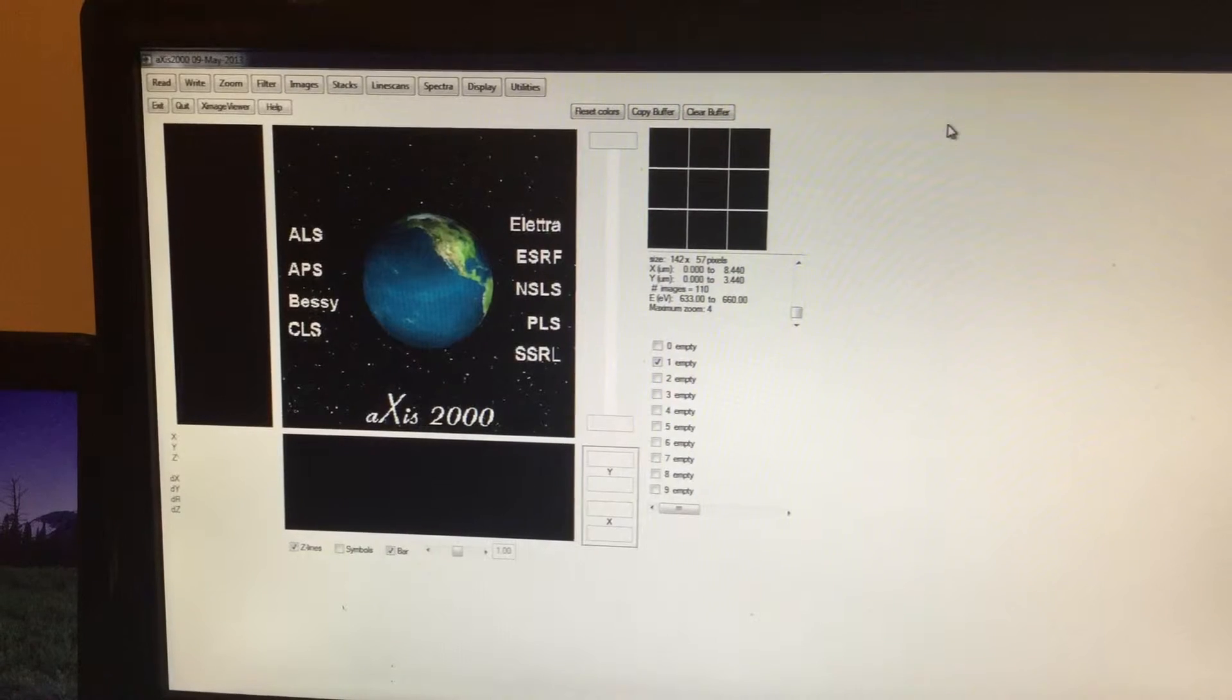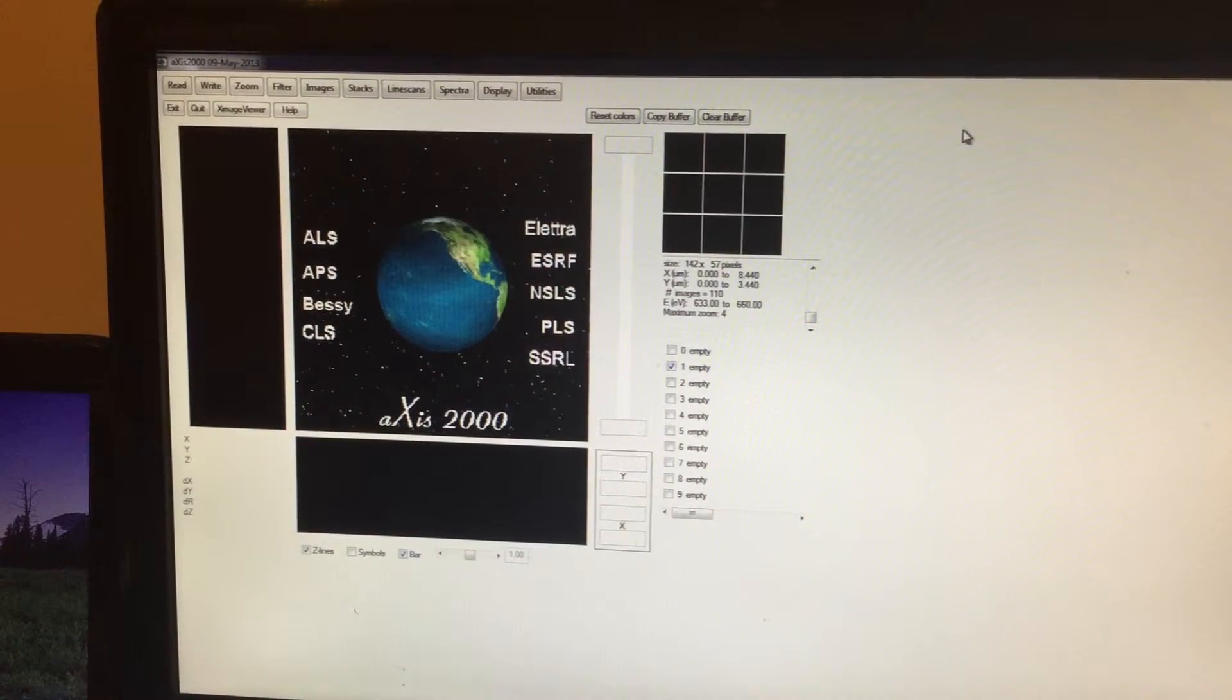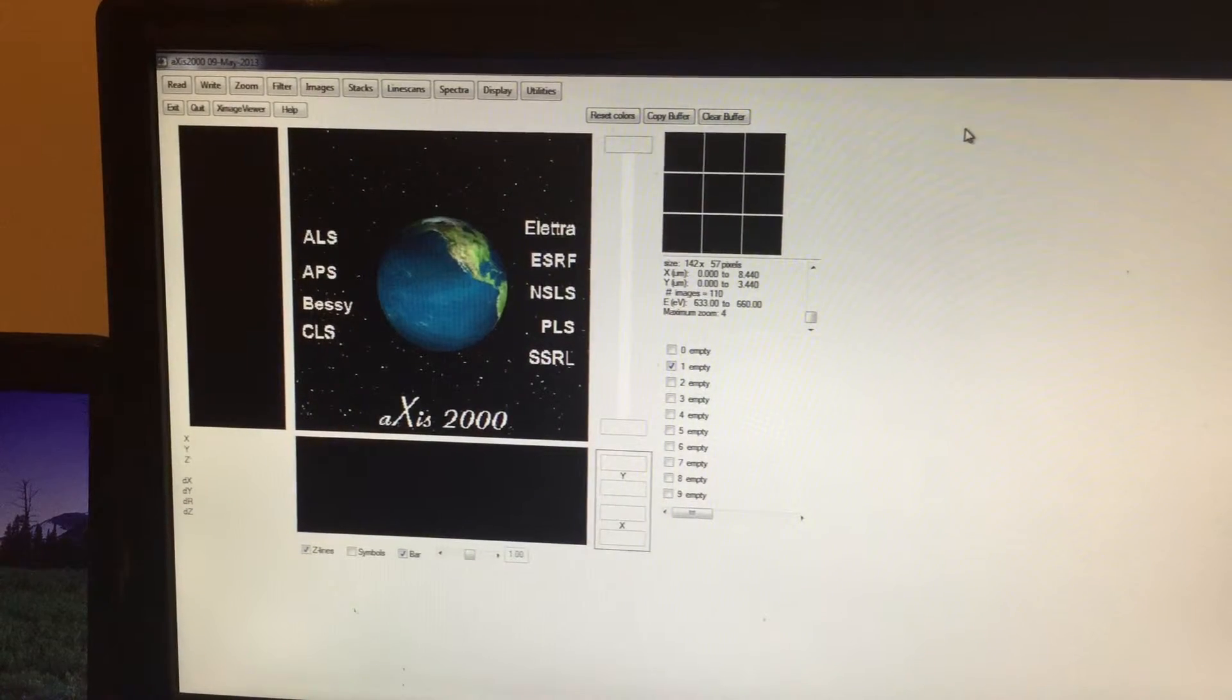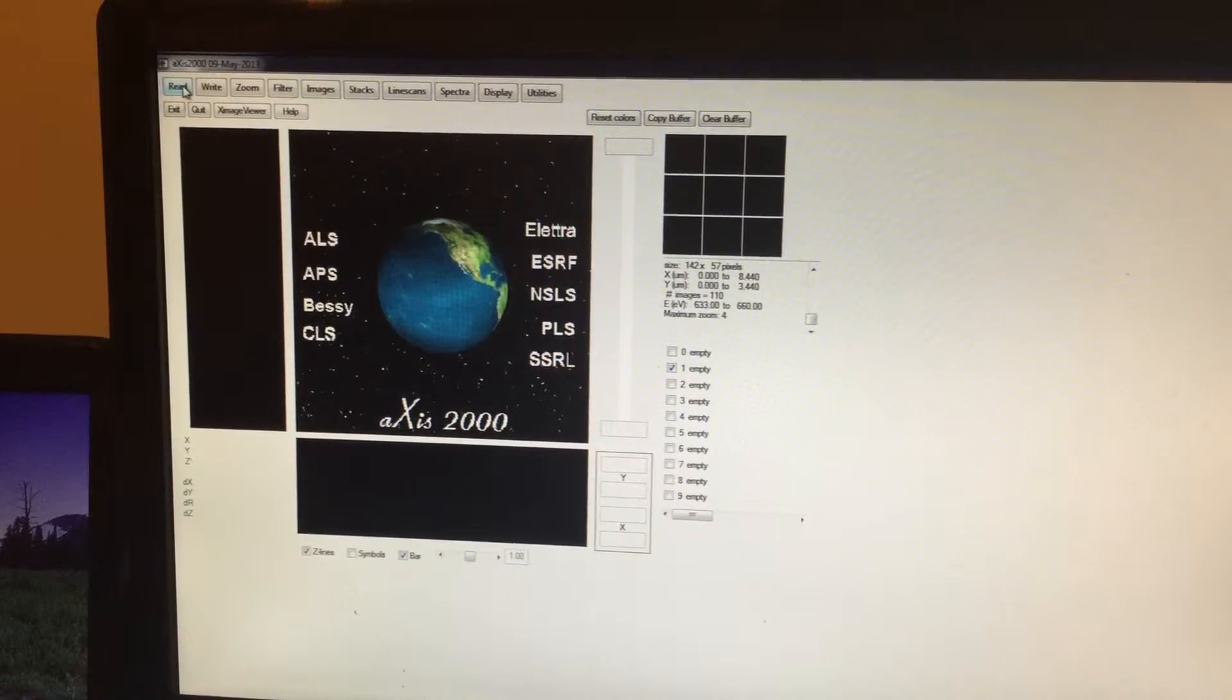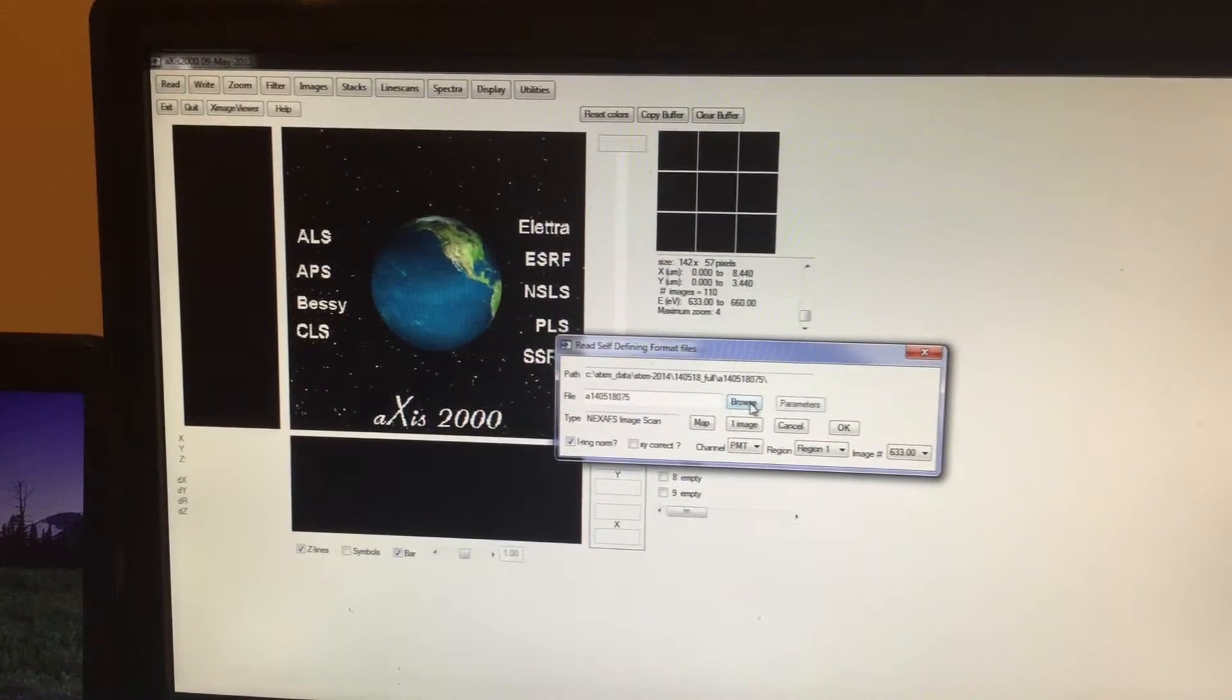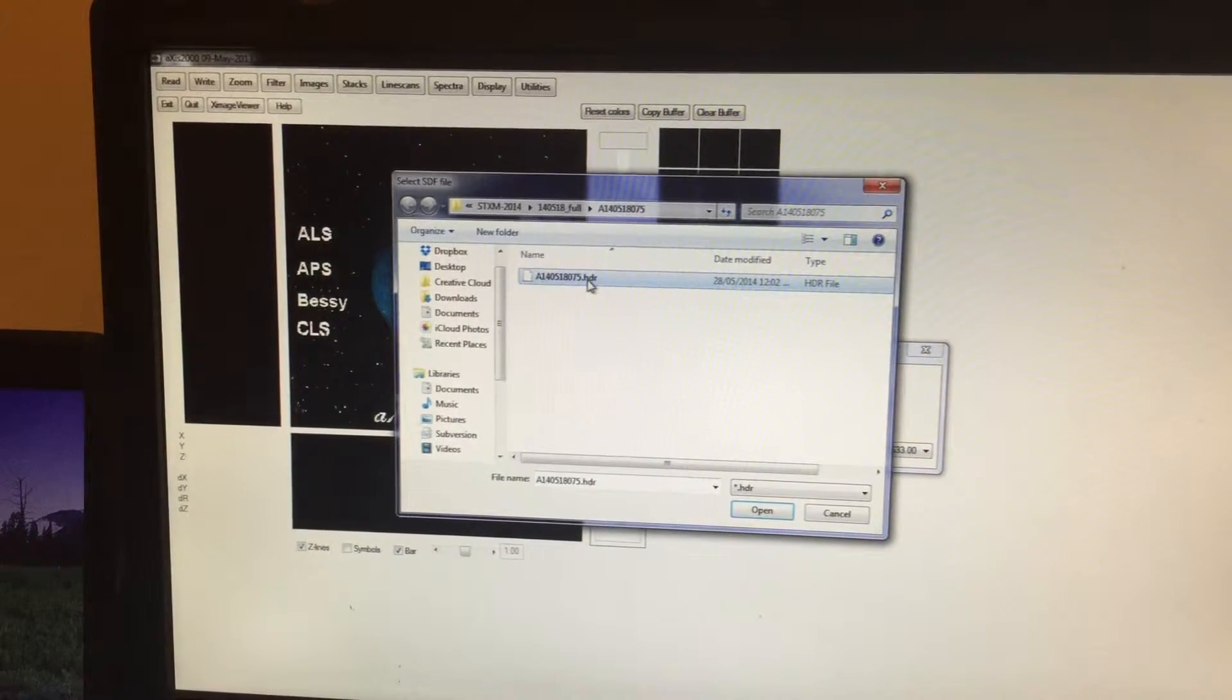Similarly, we are going to load the data corresponding to RCP, or the right circularly polarized light. You will repeat the same step, so click on Read, click on STICSUM, then click on Browse.